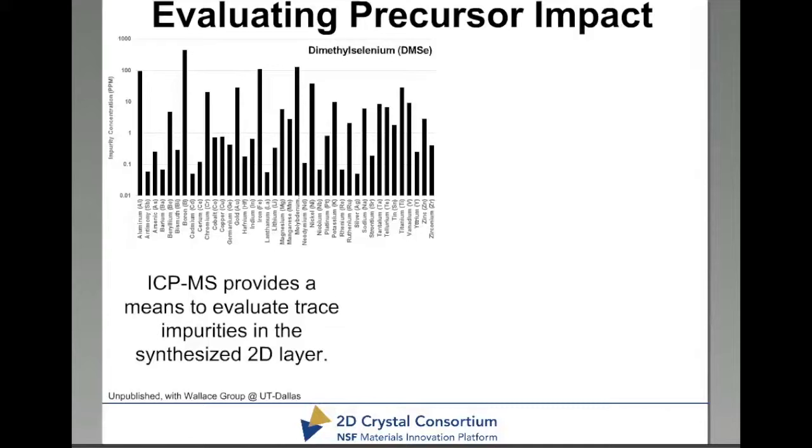So to start off, we put our sample, that's in the bottom left of this schematic, and we ablate the surface with a laser, and that ablated surface then gets pushed with a gas up into a plasma. This is directly below the MS in the ICP-MS for those online. And there's a nice picture of it in the bottom there with the arrow coming out.